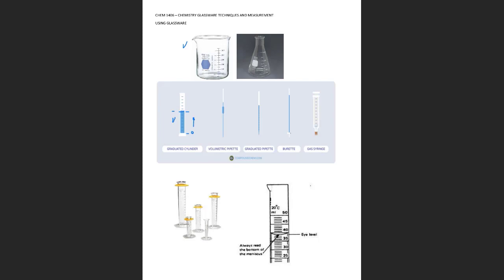Well, first of all, when you put a liquid in, the liquid is not exactly straight. See, the liquid will curve a little; this is called the meniscus. It's going to be attracted to the sides of the graduated cylinder. So when you read, you have to do two things, and they are going to ask you in the quiz. First of all, when you have the meniscus, where do you read? You read the bottom of the meniscus.